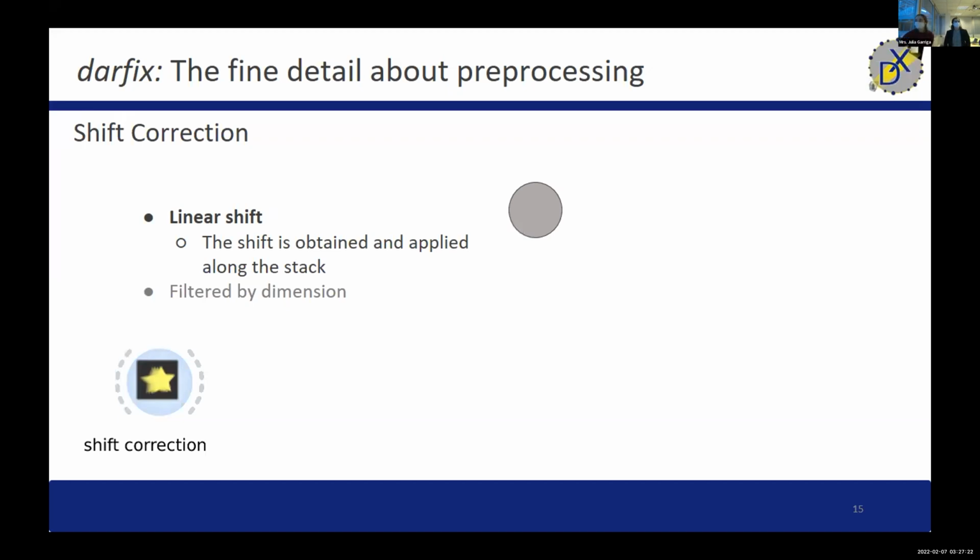If it happens on the step scans, normally it only happens when you have very, very small steps, so you are kind of flirting with the limit of the resolution. Actually, it's maybe the number of decimals that Silex accepted. And so then you have to impose the step size. But if it's a step scan, it should be corrected in a future release, because we just saw it last week. Some of the step scans were wrongly taking the resolution of the step size. Yeah, it's a sub-scan. I remember now. Thank you.